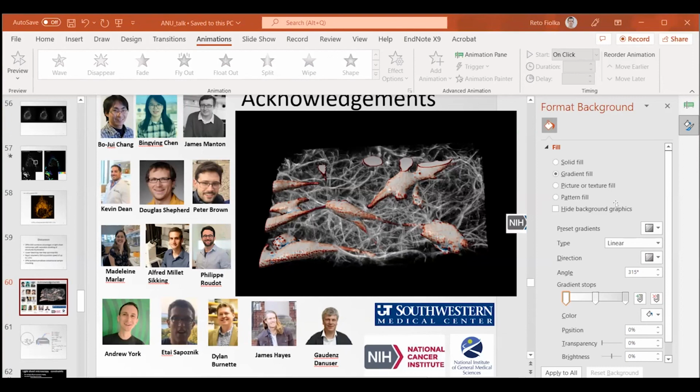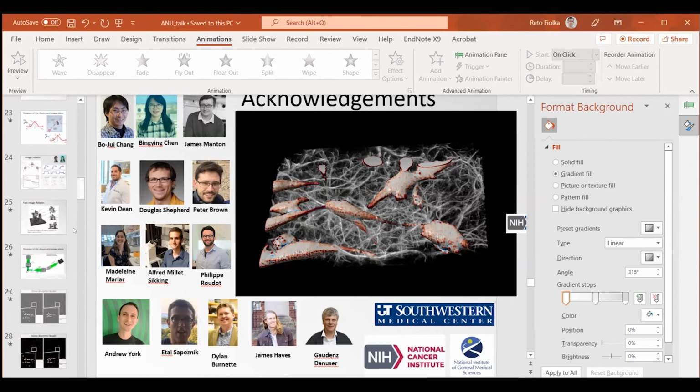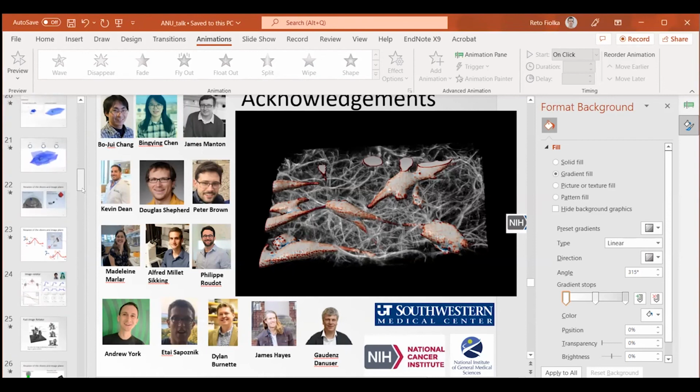I had a question. When you were talking about doing the interference with the two sheets and rotating them around, how are you generating those sheets to generate those lines in the focal plane and to switch through? Are you using an SLM in that case?